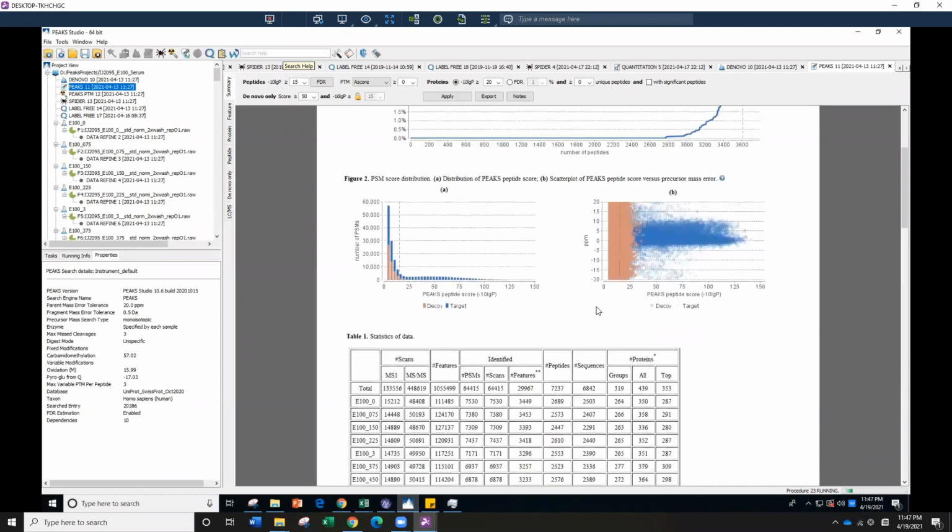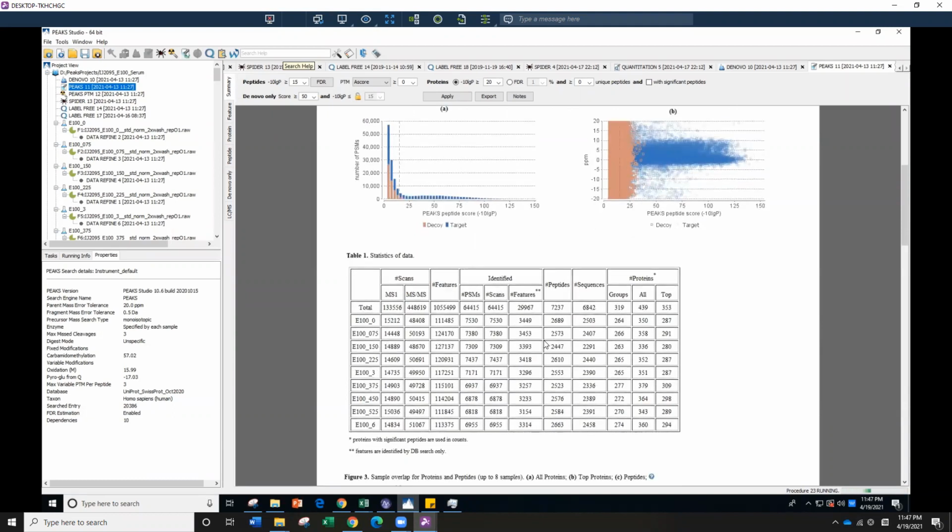Okay, so here, like I said, this is a nice set of samples. It tells you for each one how many MS1 you have, how many MS2 you have. Just looking at the nice samples, we are looking at about a million features. Like I say, this set of samples takes more than 24 hours to finish the analysis, or about 18-ish, a long time. So the more samples you run, just be prepared to have more time, and also this set of samples has some PTM I'm looking for specifically.